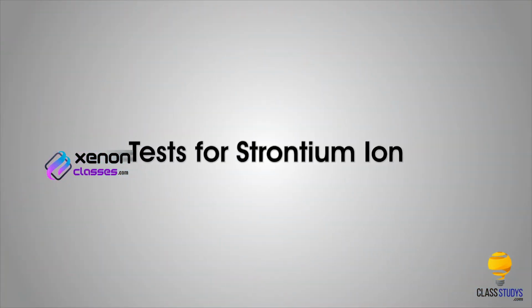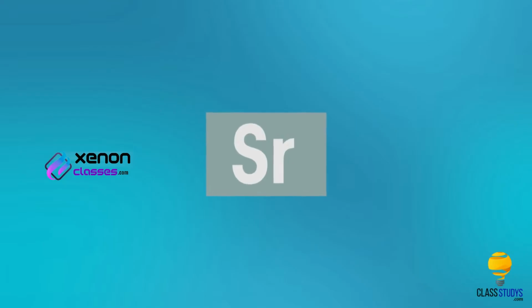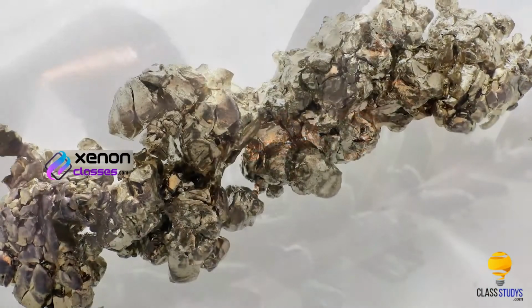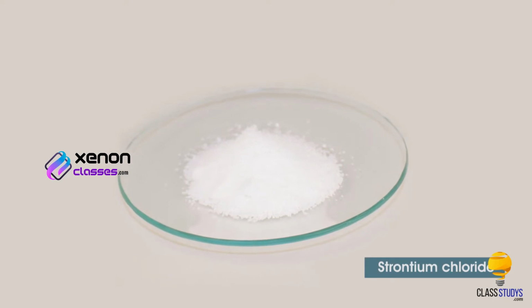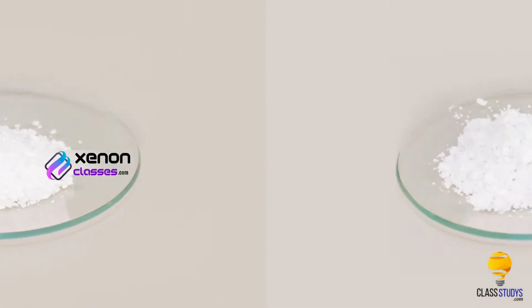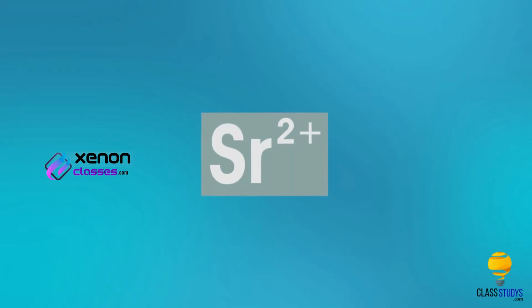Tests for the strontium ion. Strontium is a chemical element with symbol Sr. It is a soft grey silvery metal. It is found in various salts like strontium chloride, strontium nitrate and strontium carbonate as strontium 2+ ion.